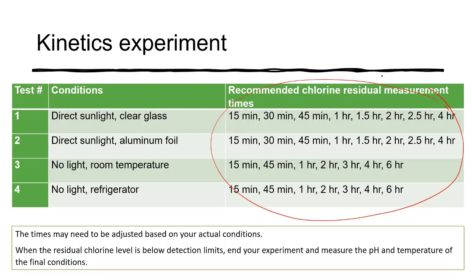And then once the residual chlorine level is below detection limits, so where you can no longer detect any residual chlorine, that's where you'll end the experiment. So you may or may not need to go out as far as I've included here. It really depends on how rapidly the chlorine decays. It's going to depend, especially when you're outside, on weather conditions.